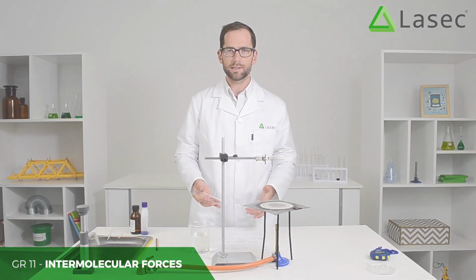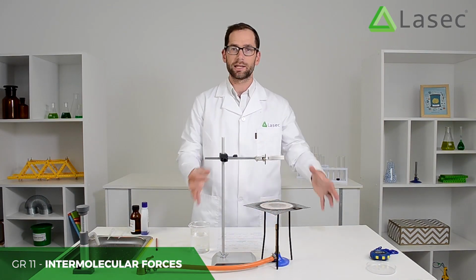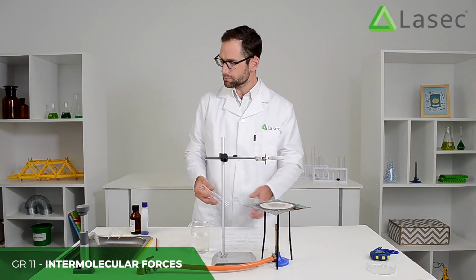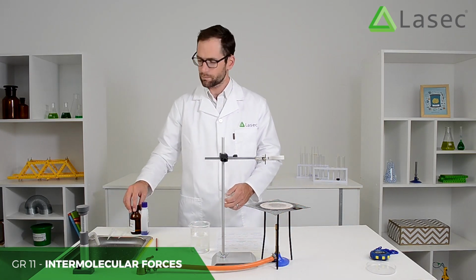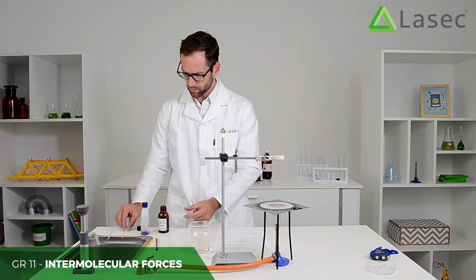So now we're taking a look at the boiling points with intermolecular forces, and I want to clear my workspace a bit because I'm working with a flame, and we're going to start off with some ethanol. So what I'll do is I'll measure off just 5 mL of ethanol into a test tube.